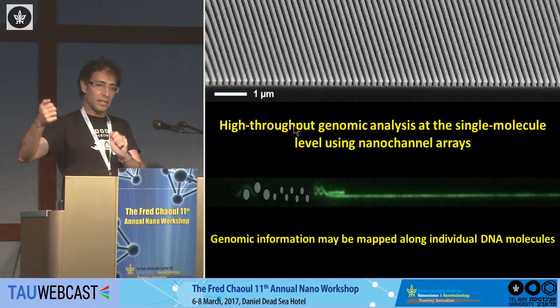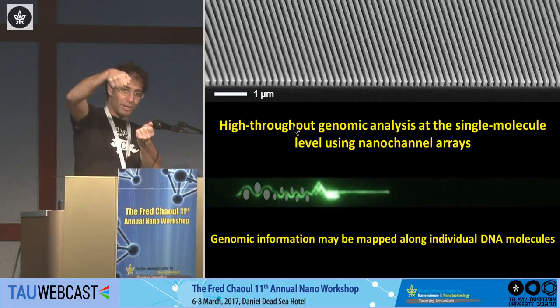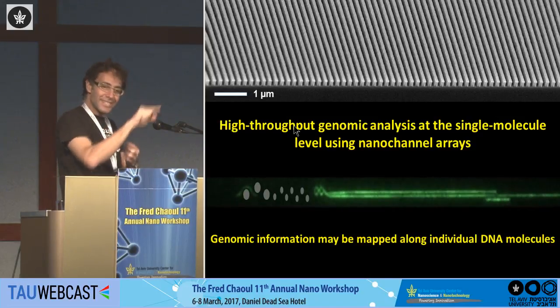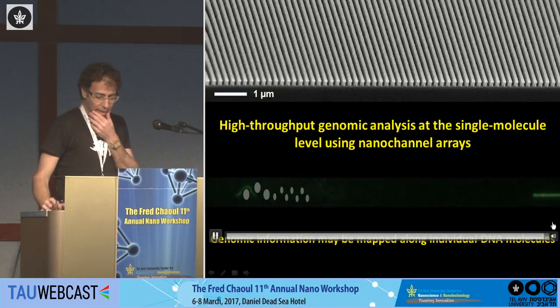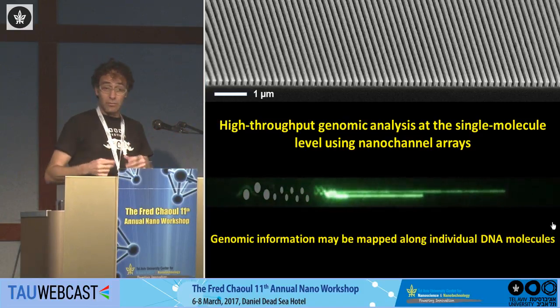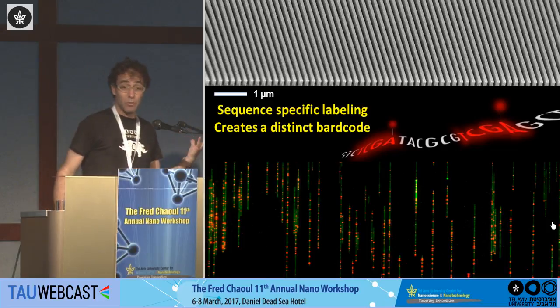Just like your spaghetti in the spaghetti pot, where you put this thing with the holes, you take the water out, the spaghetti stays in the thing. But if you had a mechanism that will shape each one of these spaghettis to be against the wall, they will go out, and this is exactly what we do here on the nano level. And again, due to this confinement in the nanochannels, physically and entropically, the molecules have to stretch out. And now we have the potential of reading information along these molecules.